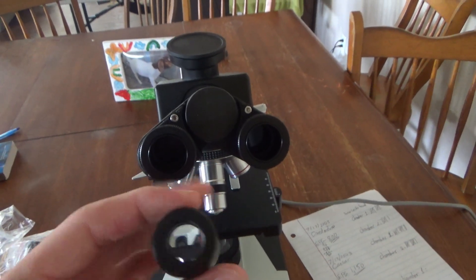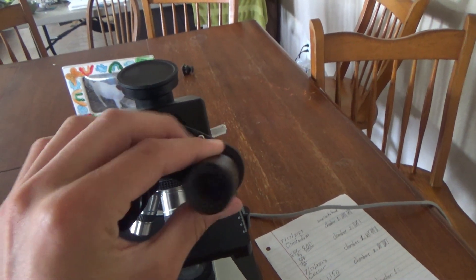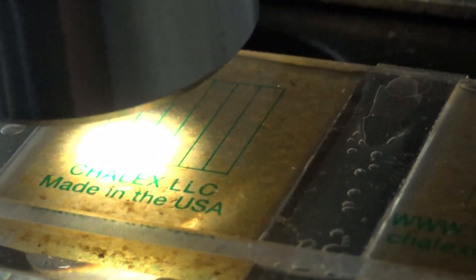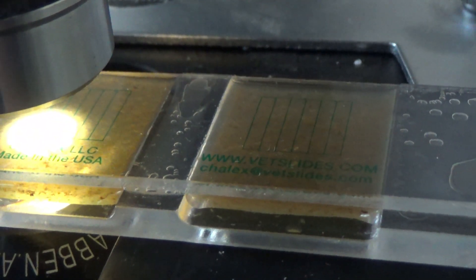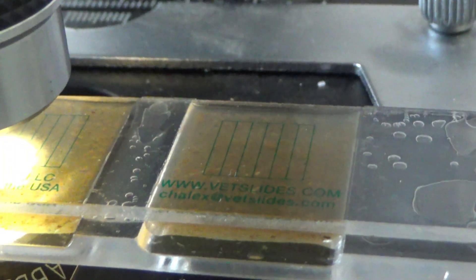I've got my microscope set up here. One important thing I learned after a year or two of trying to do this is to add 10x magnifier eyepieces, otherwise you will not be able to see the eggs — it will be too small. The way a McMaster slide works is you count the number of eggs you see in each of these little bars, each of the chambers on each side of the slide. You count this side and then you count that side, then add them up and multiply that number by 50 to get the total number of eggs per gram. What we're looking for is Haemonchus contortus, or barber pole worms, because that's what really affects goats the most.